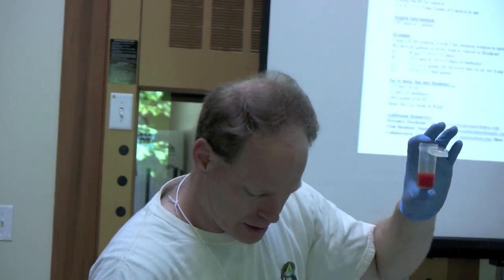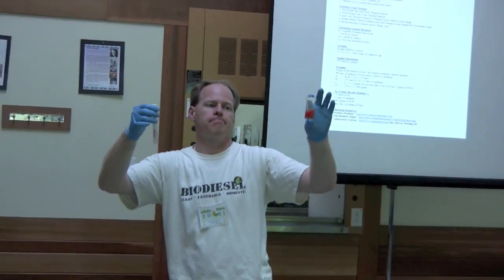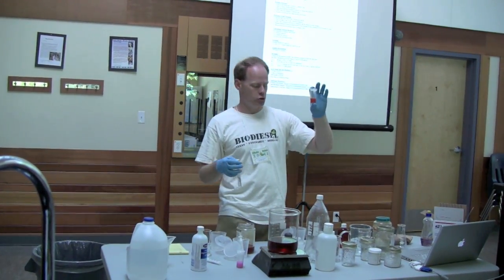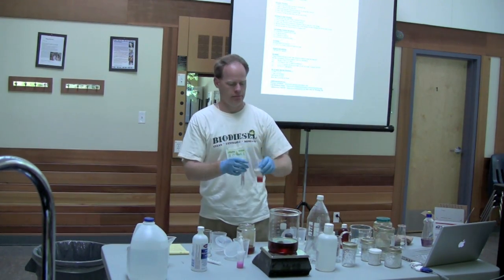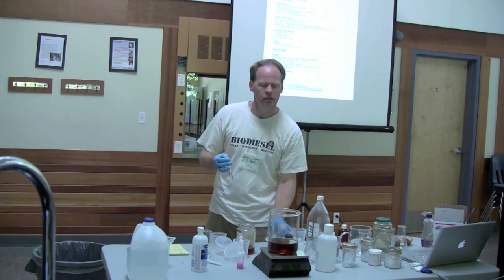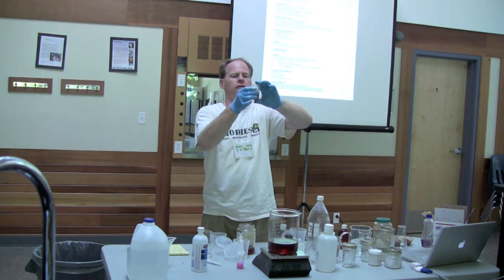This one's interesting though, because this one took, I'm down to 7.5, which means I'm through, let's see, 2.5. So this does indicate sooner. So it's possible that if you do use turmeric, you could slightly underreact your batch, which means you may want to add a little bit more. Will it change color more if you have the rest of the 4? Nope. There's the rest of it right there.